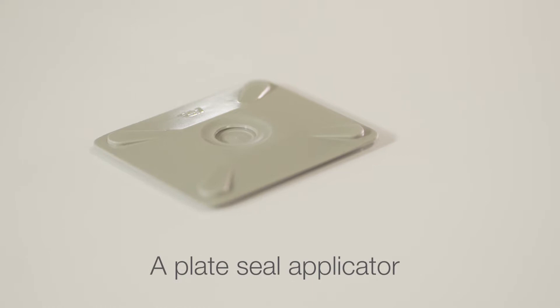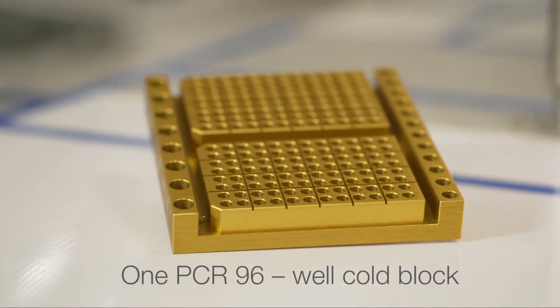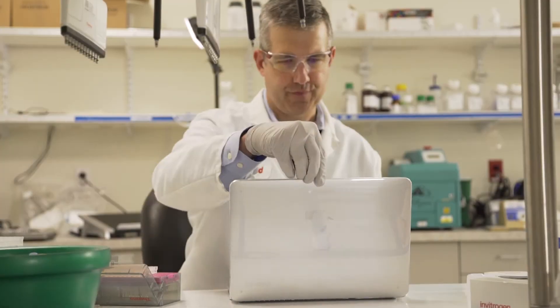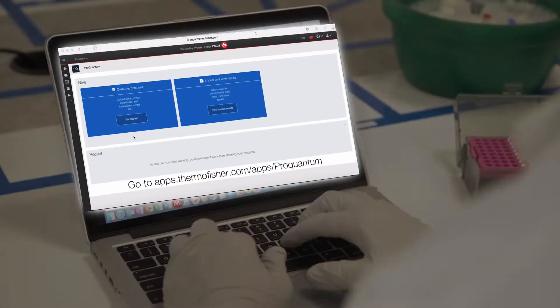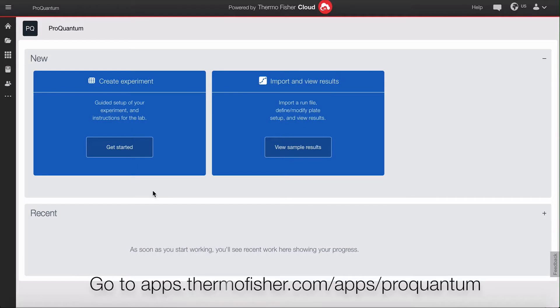A plate seal applicator and a PCR 96-well cold block to keep the reagents in the working plate cold. We will first show you how to use the ProQuantum Cloud app to help set up your assay.